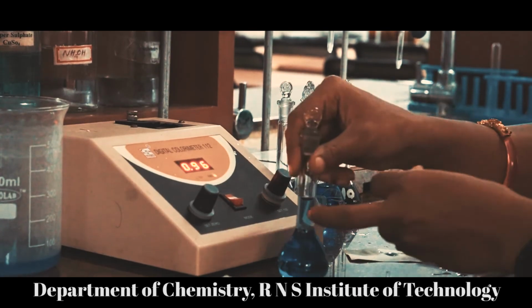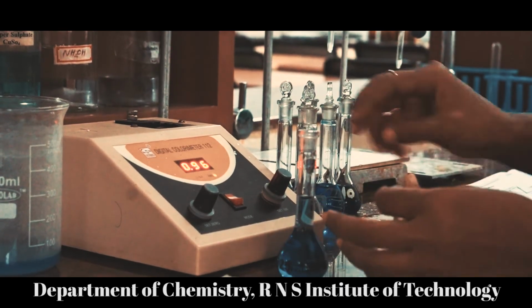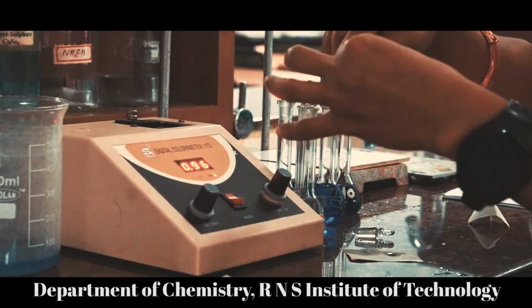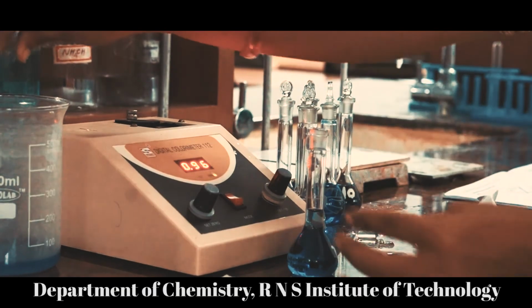Now we are taking the absorbance of the unknown solution. Rinse the cuvette with the unknown solution.